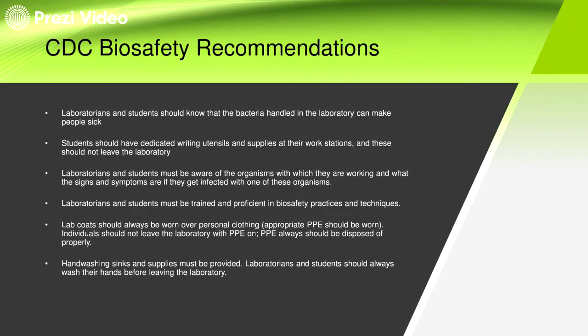So, what are the recommendations of the CDC to make sure that the lab will actually be safe from all of this biological risk? First is that all of the labs and laboratorians and students should know that the bacteria handled in the lab can make people sick. So, definitely, if you're going to work in a laboratory that has microbiology, you should be knowledgeable about what those bacteria are. That's why microbiology is part of our course.